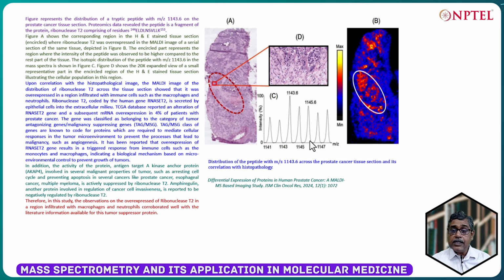So, something else has contributed and the spectra picked up both together, so that intensity got summed up here. Anyway, that is a separate issue, but this is the peptide and its isotopically distributed peaks are present. So, this is a real one, not noise.